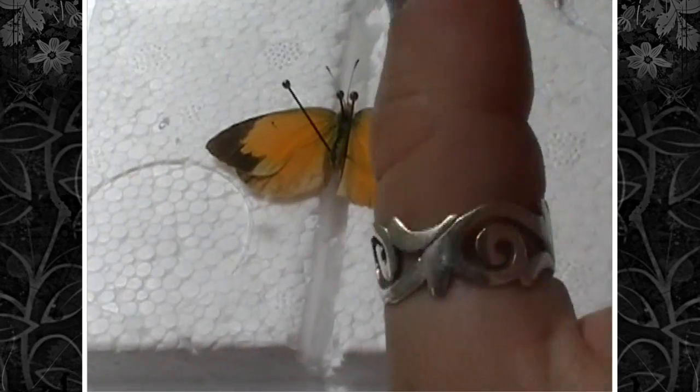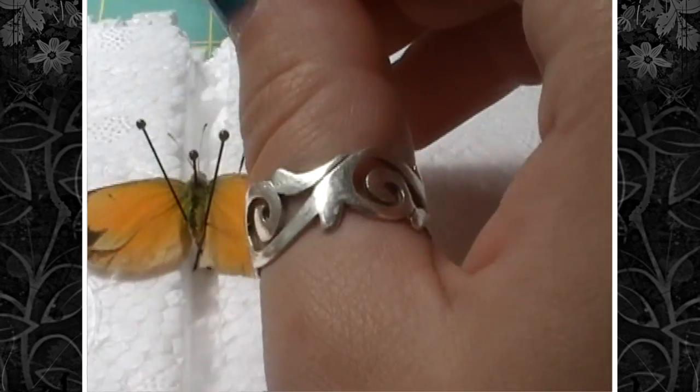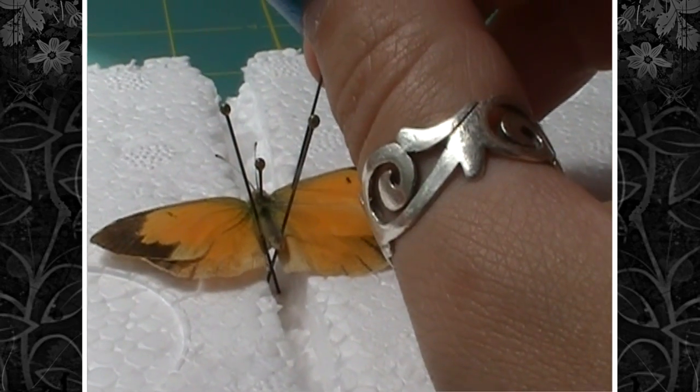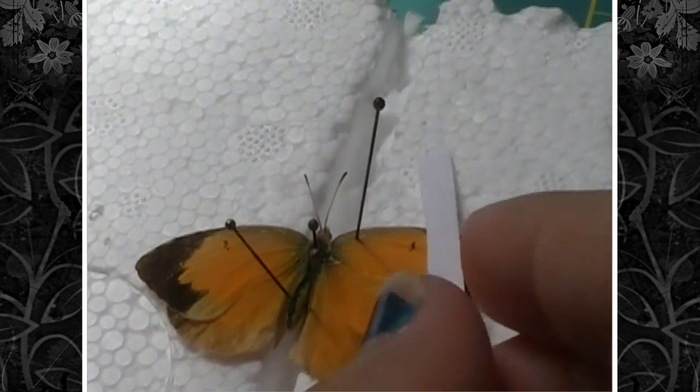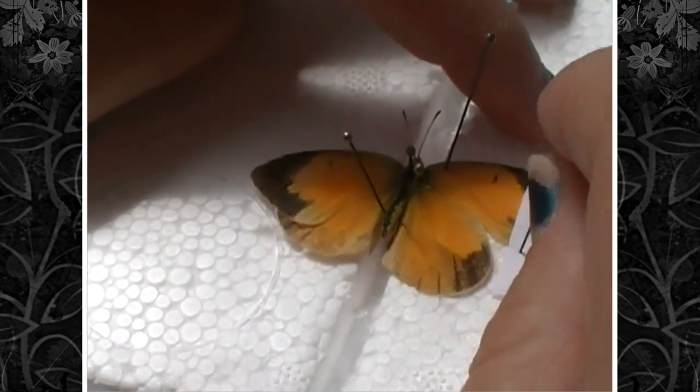Then you're going to find the pretty thick vein that runs the length of the wing margin. Gently put your pin into it and gently slide your wing up. I like stopping it about halfway, putting the pin down, and then getting a slip of paper and putting a pin at the bottom edge of the wing.